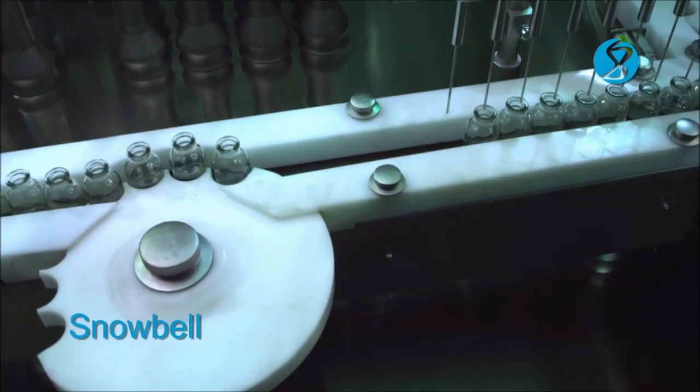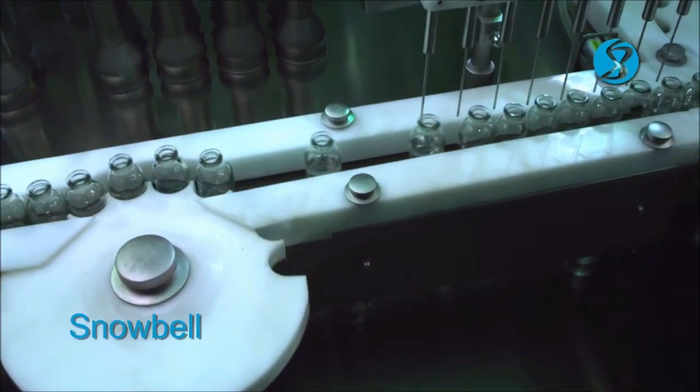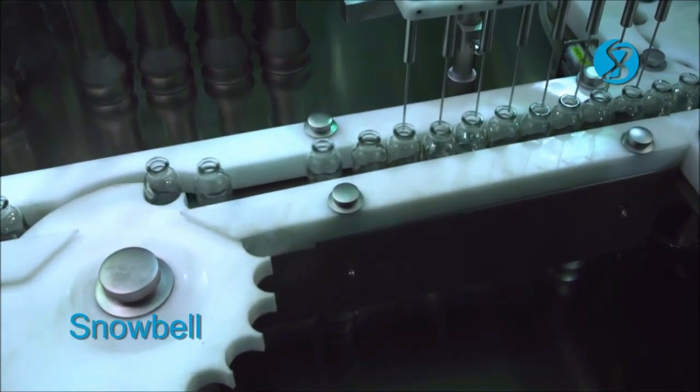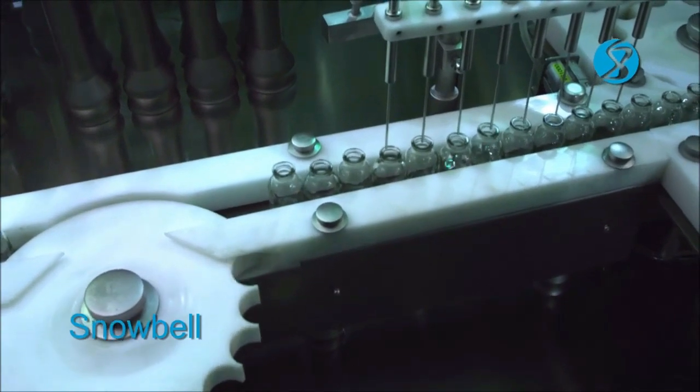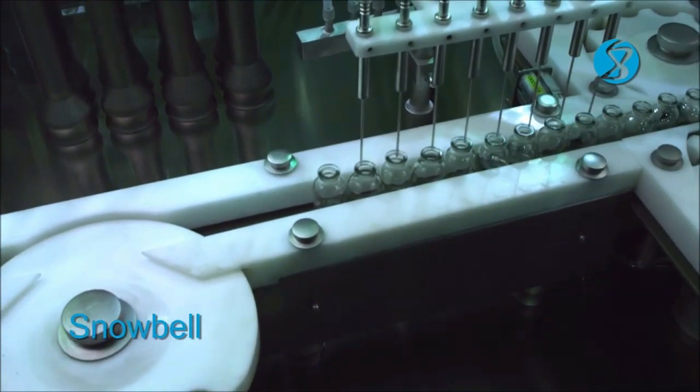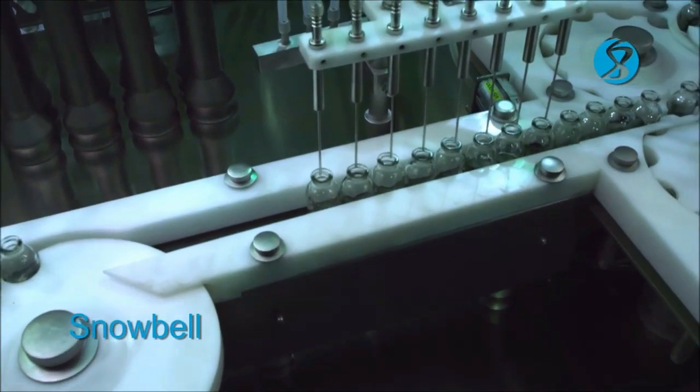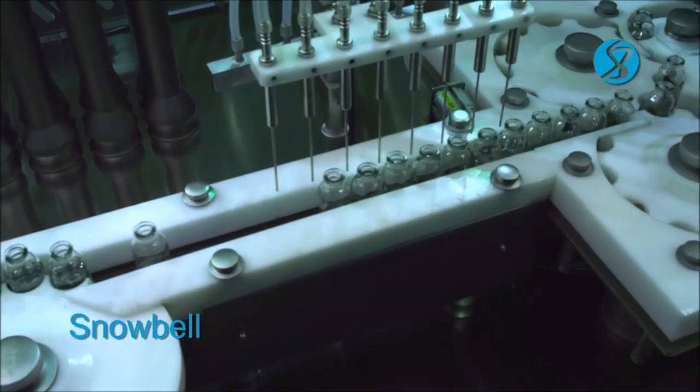At a given time, eight filled vials are released by the star wheel and are carried towards the stoppering station. Filtered compressed nitrogen is used for pre- and post-gassing of vials.